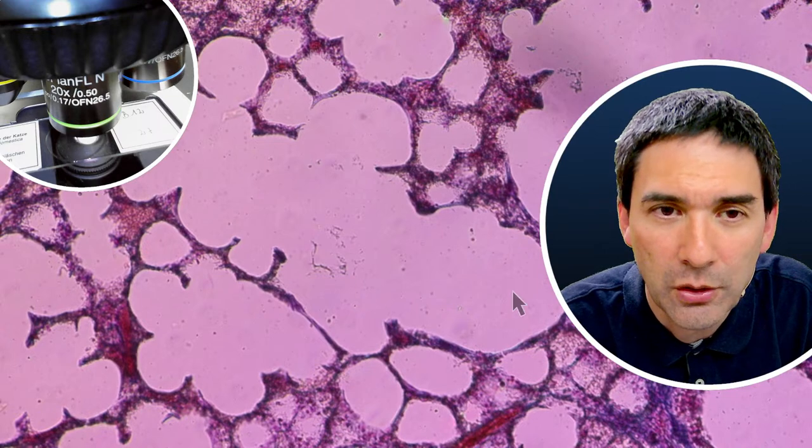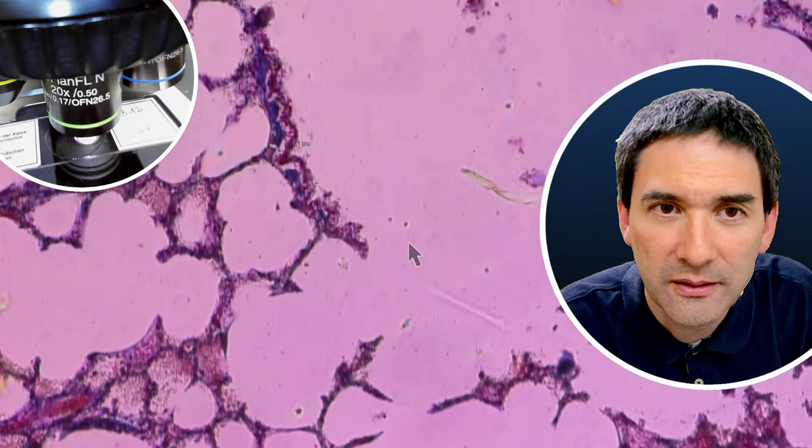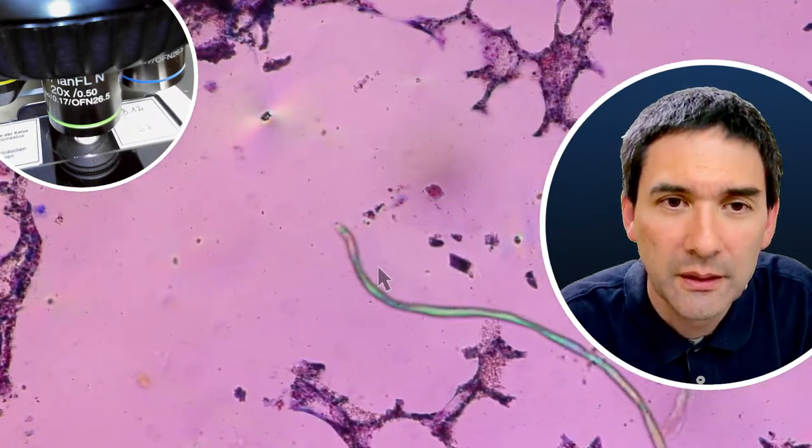The reason why over here you have those large air spaces is, I think, because of a preparation artifact. So if you cut it too thin, then you're kind of ripping away some of those walls, and then it also becomes larger like this. Like you see here, it's a little bit torn up. So, but yeah.